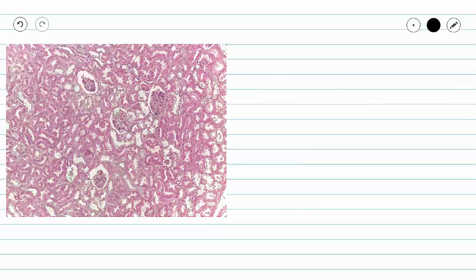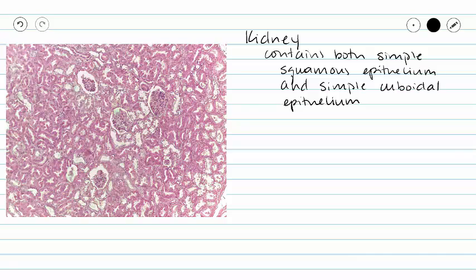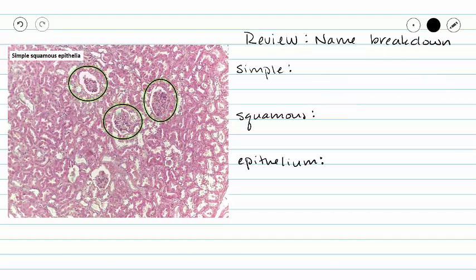This is a histological section of our kidney. As we slice through our kidney, we see lots of open spaces, and we're not just seeing simple squamous epithelium — we're also seeing simple cuboidal epithelium. What we need to focus on are these three or four areas here. What we're looking at is a group of blood vessels called the glomerulus. Then we have a space, and lining this space we have simple squamous epithelium.